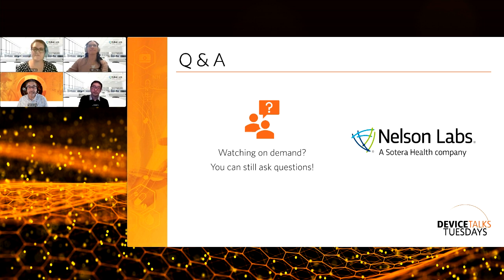Yeah, I would say a lot of companies will run cytotoxicity testing and then claim medical grade, with that being the only test that they've run. So as a caveat, in addition to what Lucas just said, ultimately the regulatory bodies want to see a final finished device so that we're accounting for all the manufacturing processes, sterilization, packaging with that one test or the one round of tests.